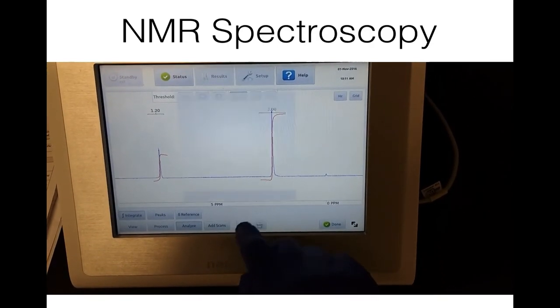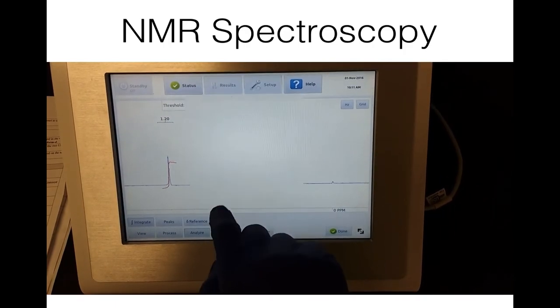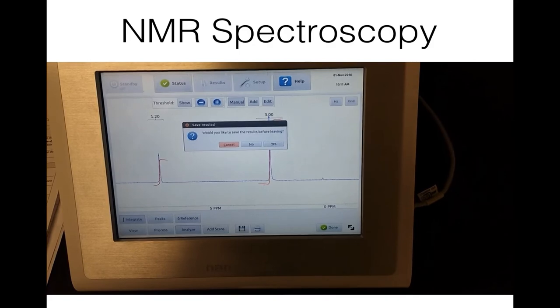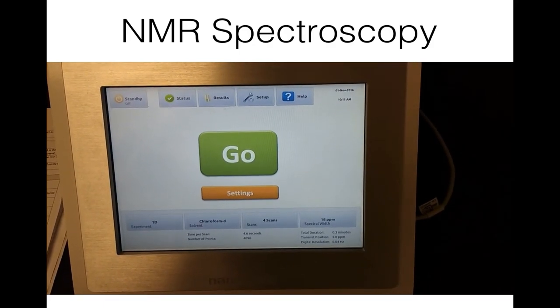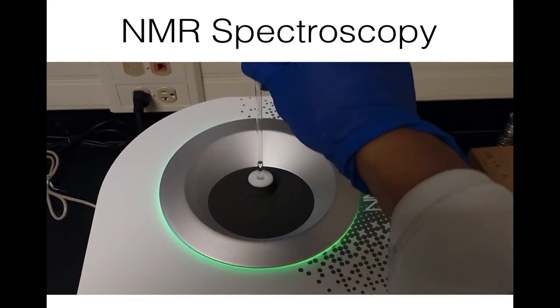When that is done, you can print out the spectrum. Carefully pull the sample tube out from the sample holder.